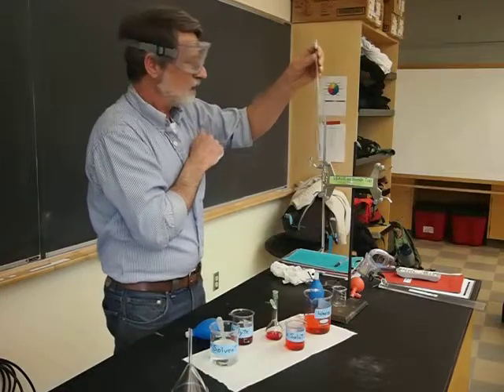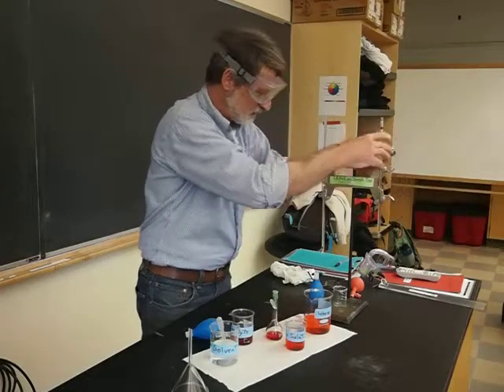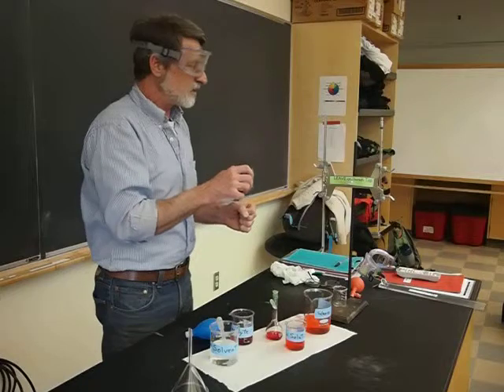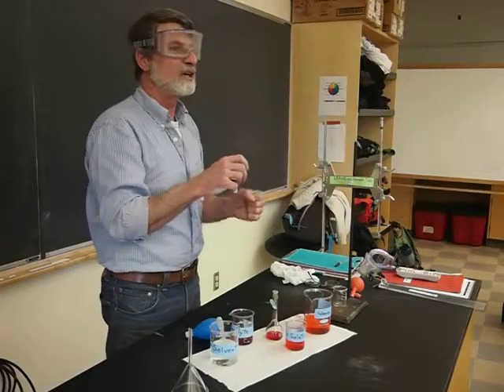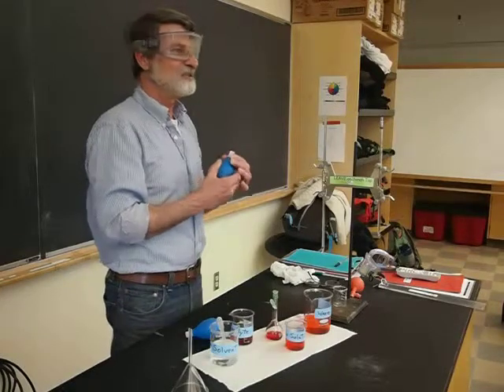Some of these pipettes have much smaller volume, so it can go very quickly. We're going to ask you to practice with water before you start practicing with the nitric acid.